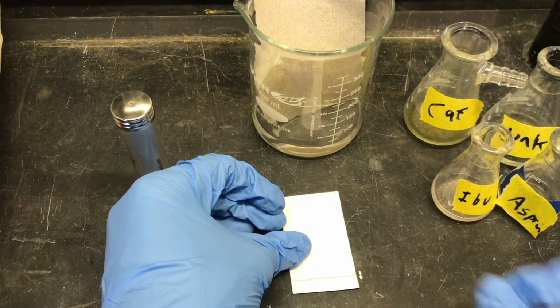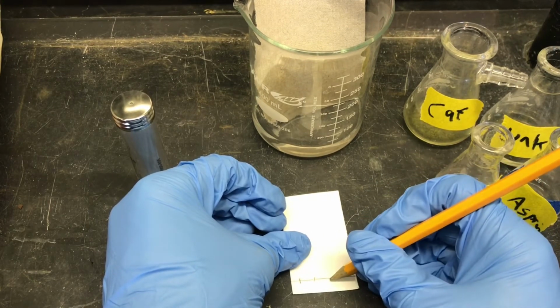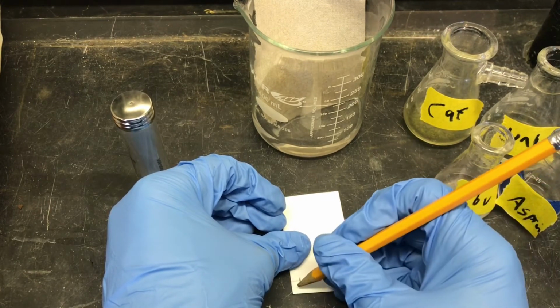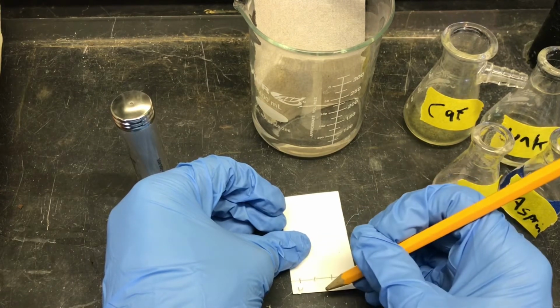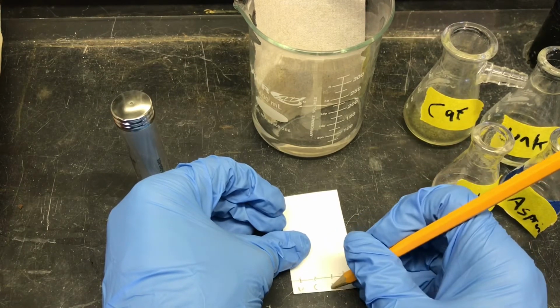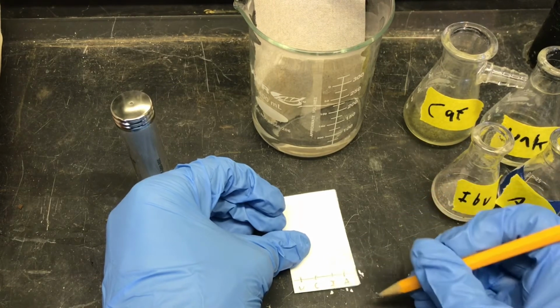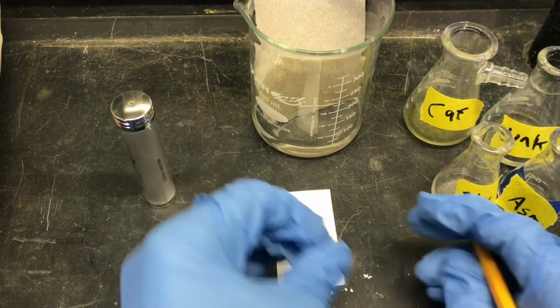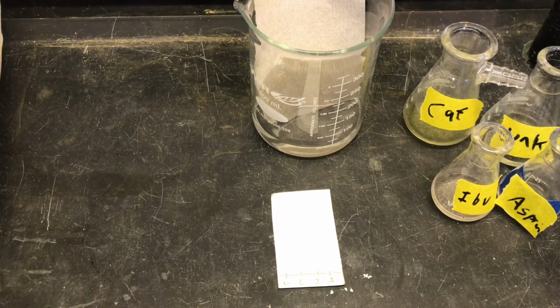Since we're testing 4 things, 4 little dashes. We're just going to do one letter labeling: U for unknown, C for caffeine, I for ibuprofen, and A for aspirin. Alright, the next thing we're going to want to do is get the capillary tubes.